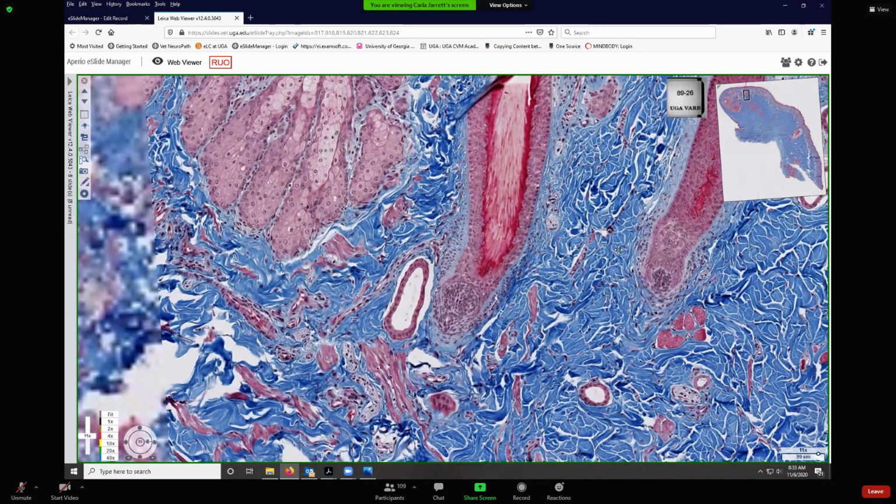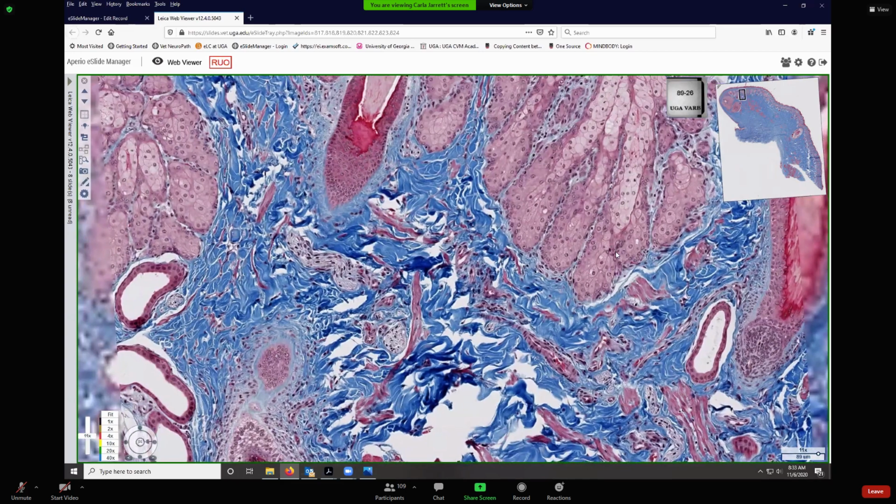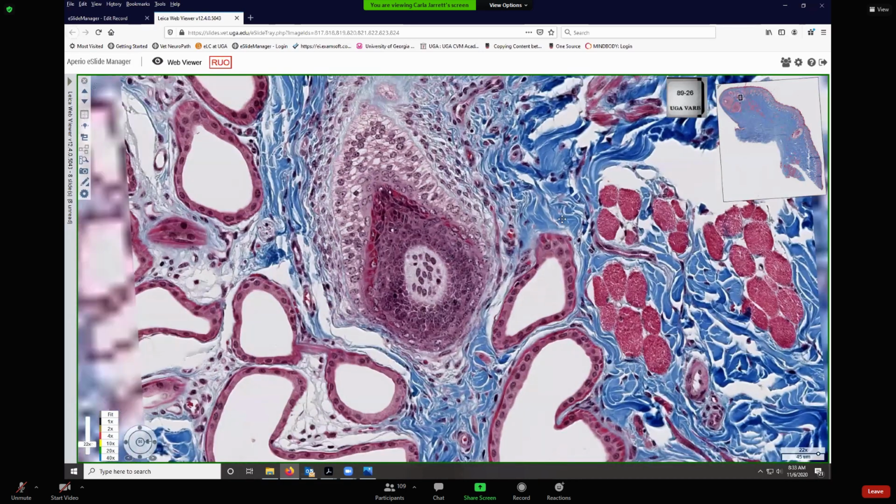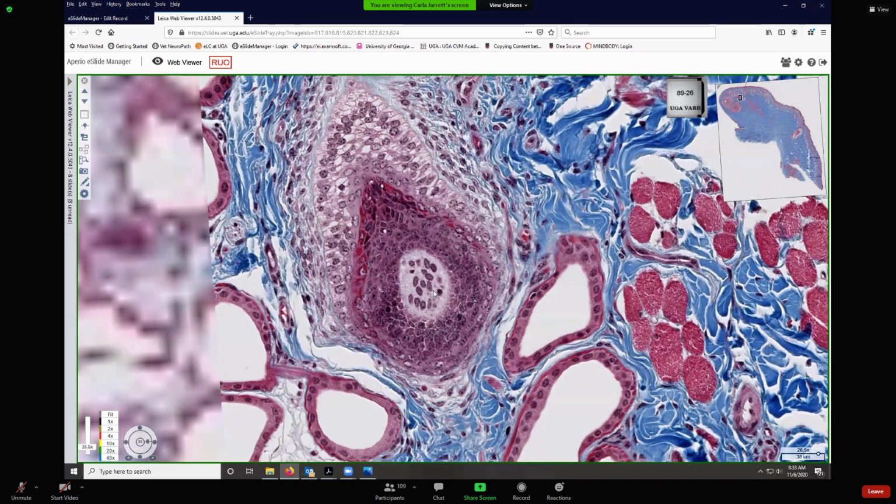And I'm looking to see if I have any other, yeah, here we go. This one shows it. We just don't see that where that dermal papilla goes up inside that upside down funnel. That's just oblique artifact. But here are all our stratum basale stem cells. And you can see this little peak right here. This area is going to give rise to hair medulla.